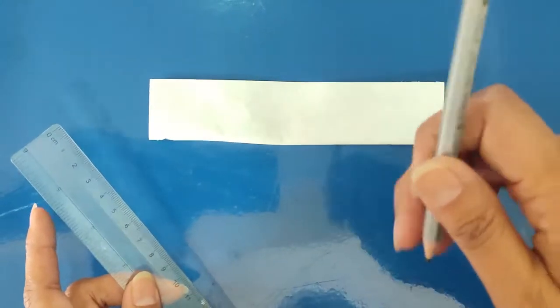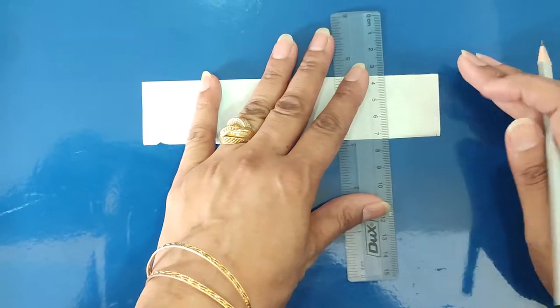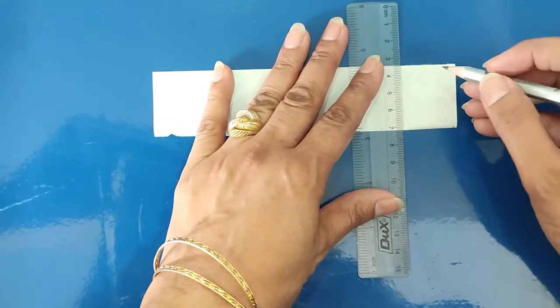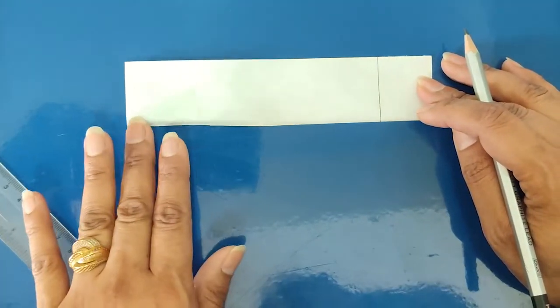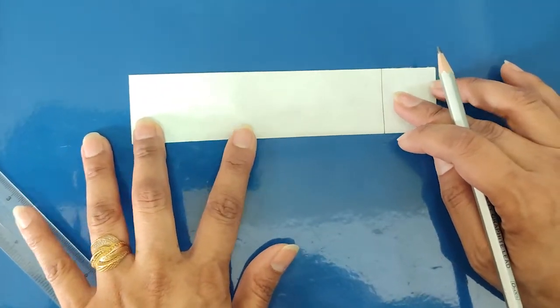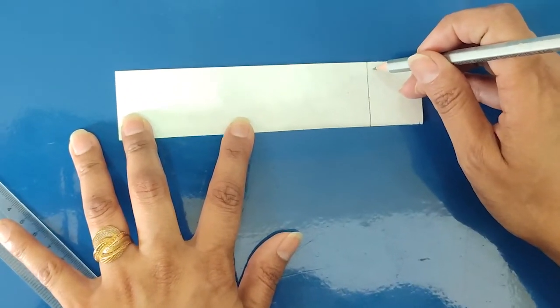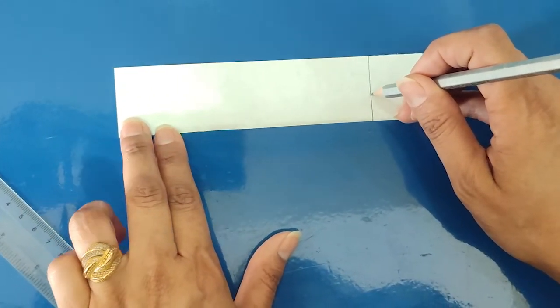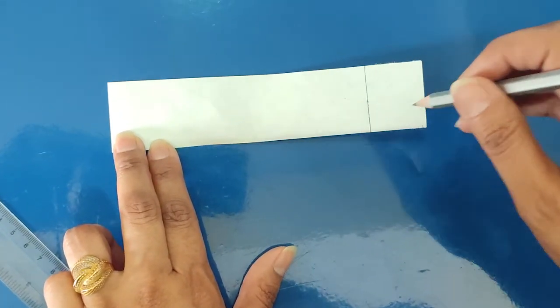For this experiment, we use this pencil and scale. First of all, at 1 centimeter, we will mark a line with a pencil. After marking this line, I will put a spot on it. This line is called the baseline. On this, I will mark 1 point to identify the separation of the colors.